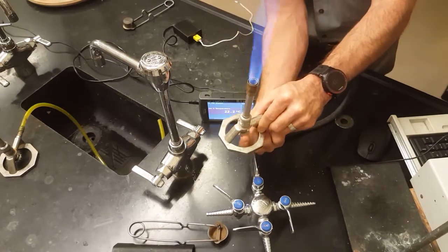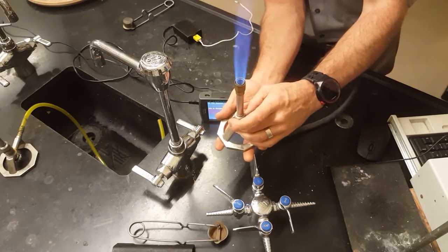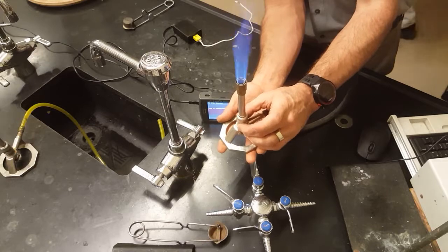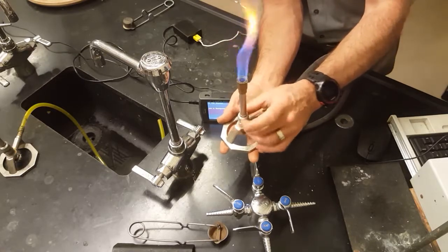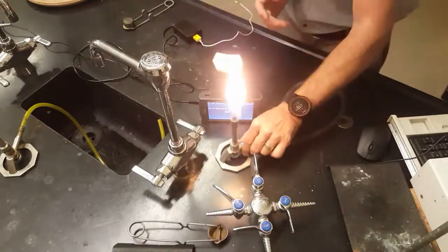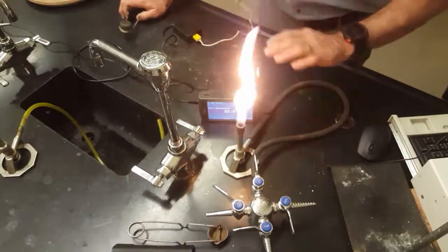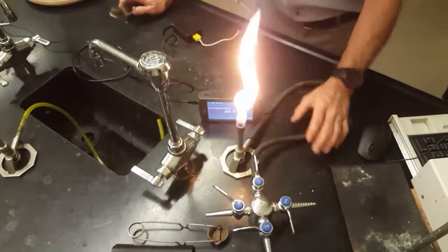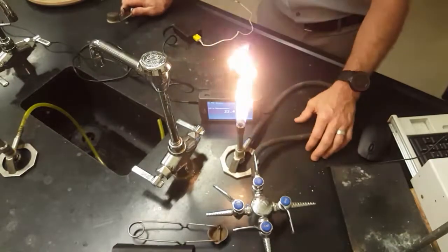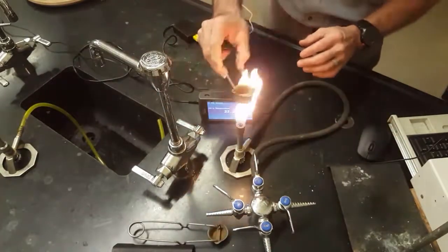I can also add more air by opening up the airport, and if I close the airport I end up with a really yellow flame. We want you to make a yellow flame today and then never again for the rest of your life make a yellow flame. It's a low-temperature flame that produces a lot of carbon.